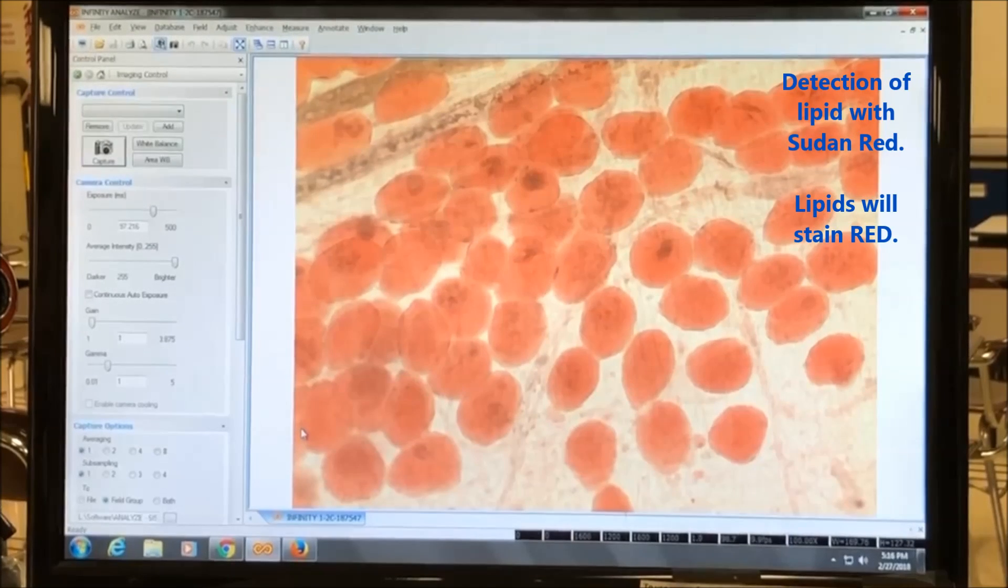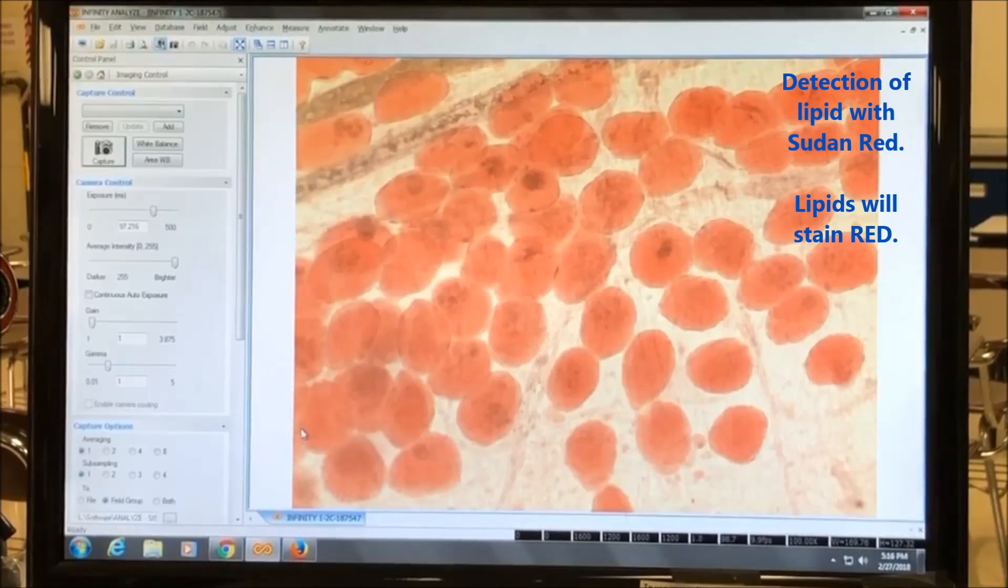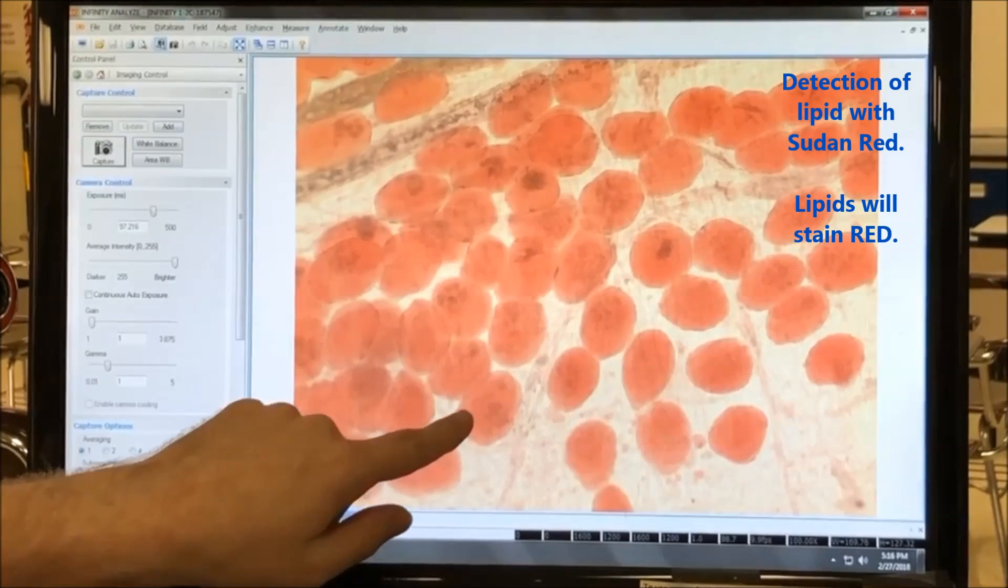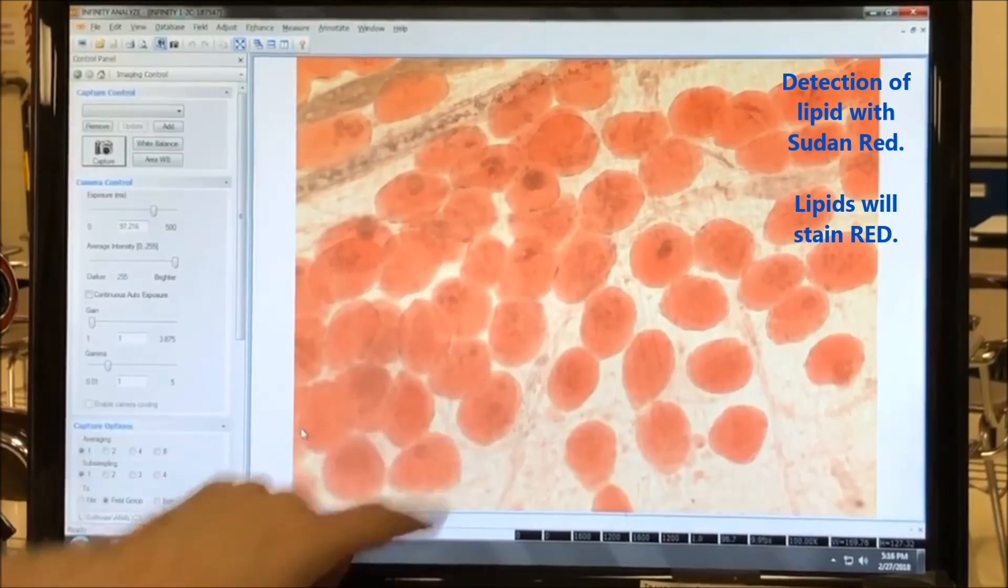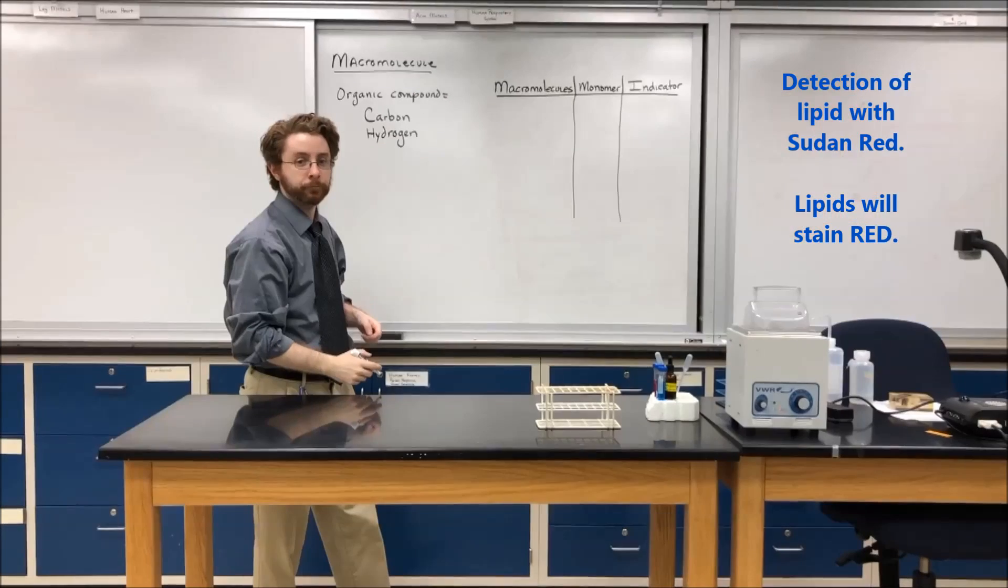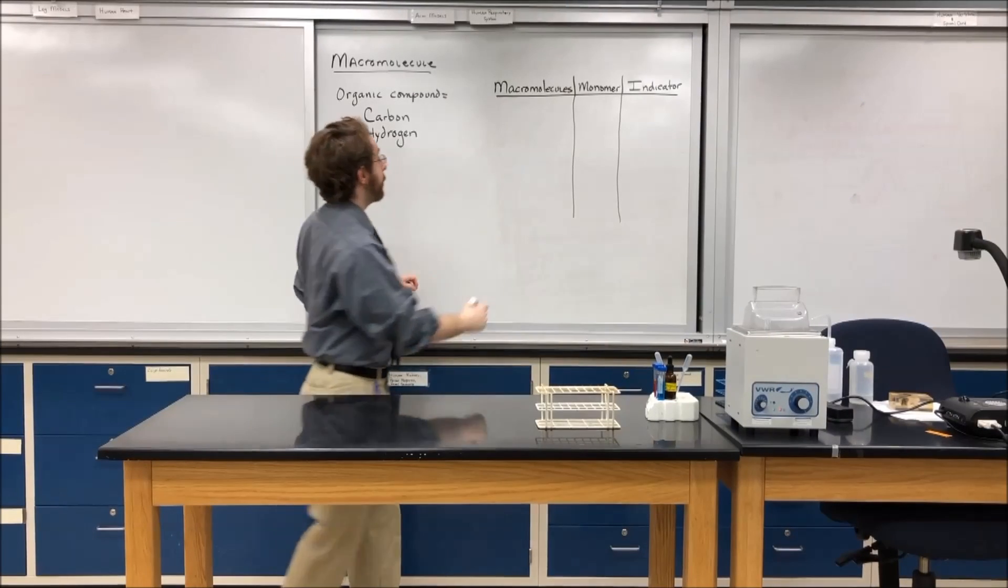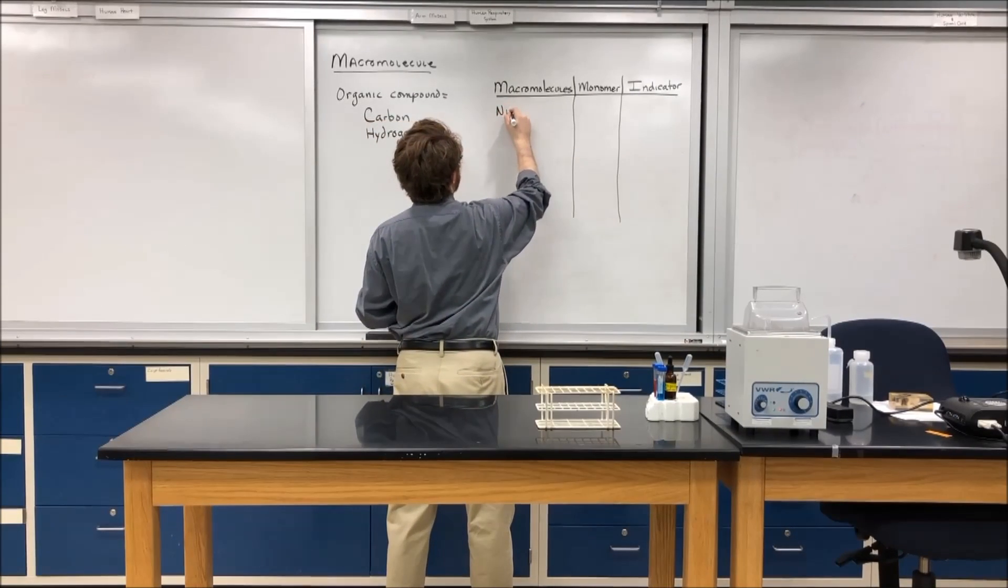To look for fat, we can use Sudan Red as a stain. So this slide here shows adipose connective tissue or fat tissue. And if you can look, you see the red spots here indicate fat bodies.